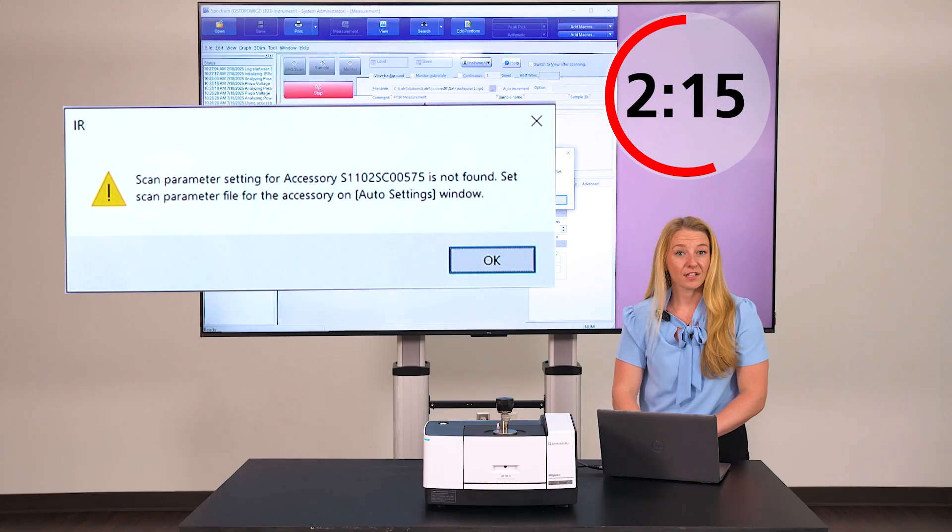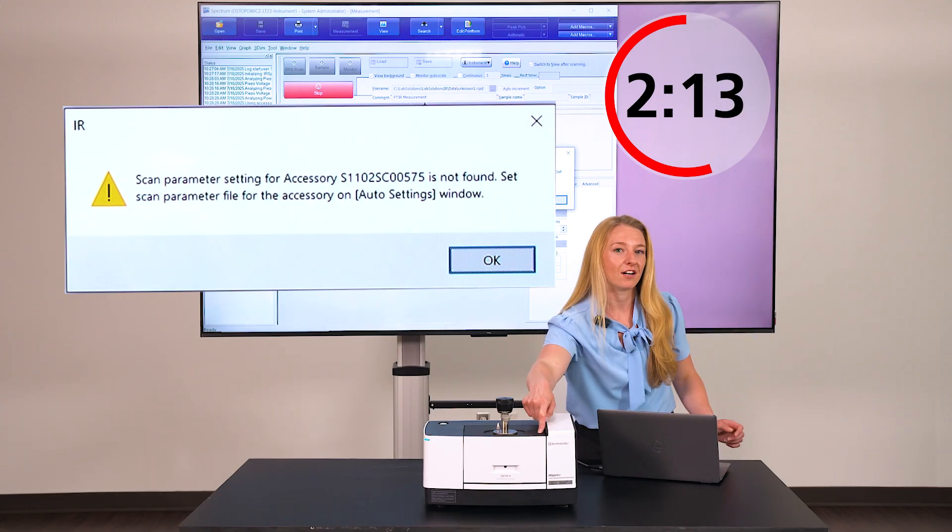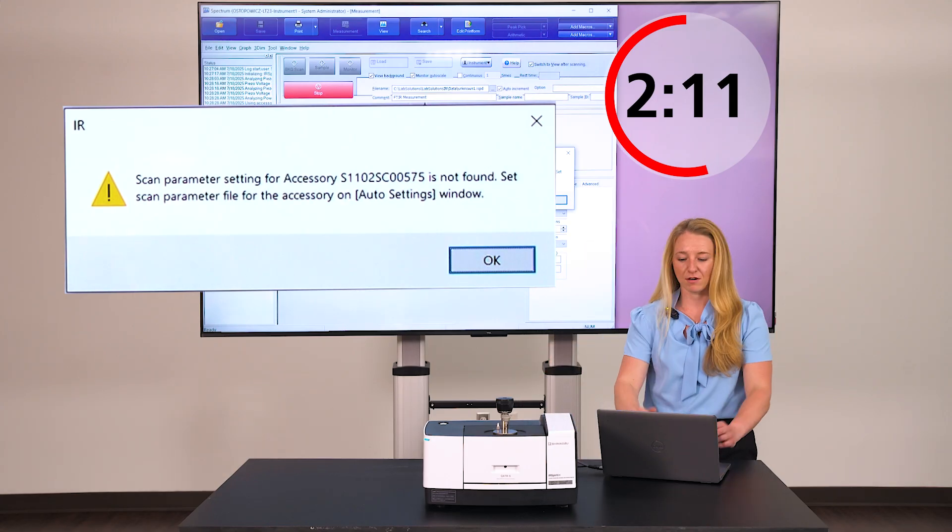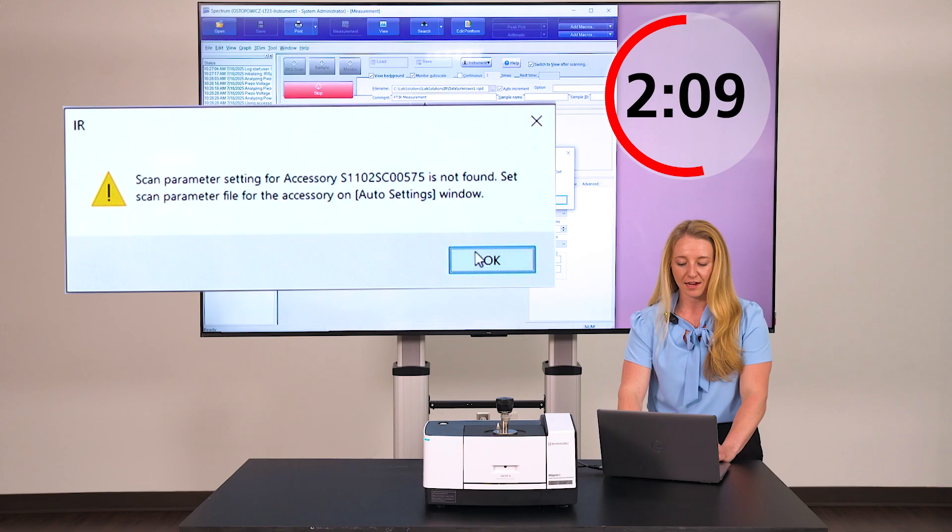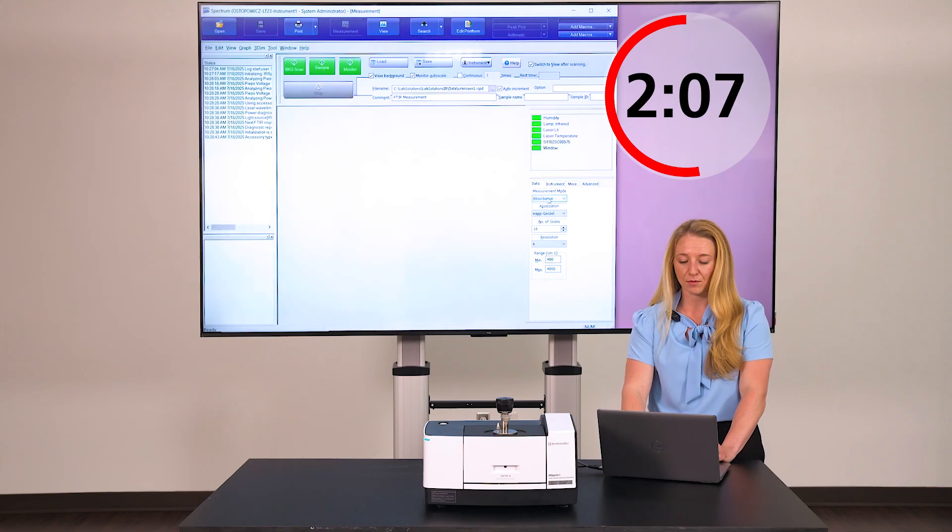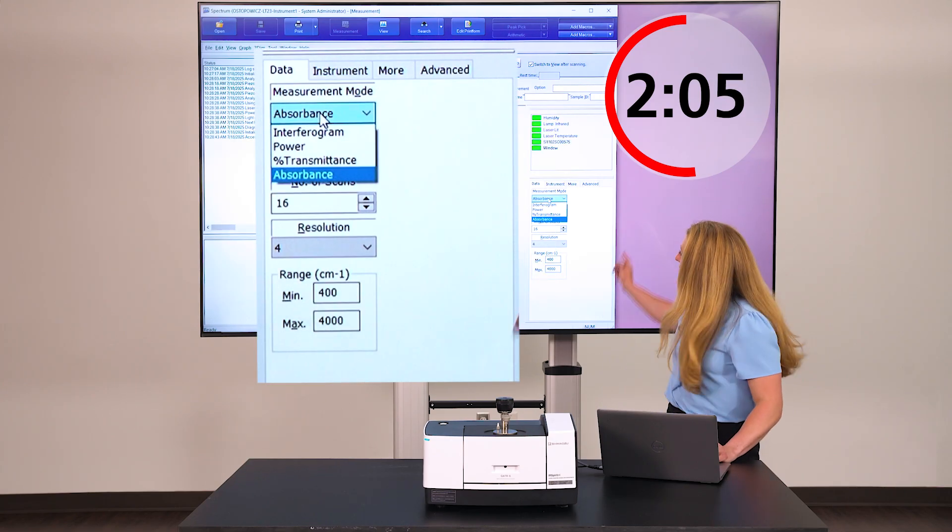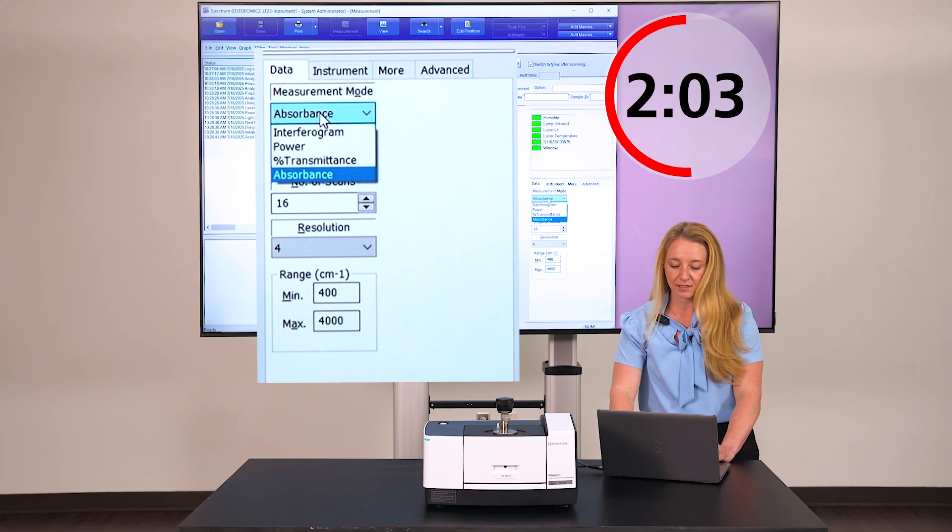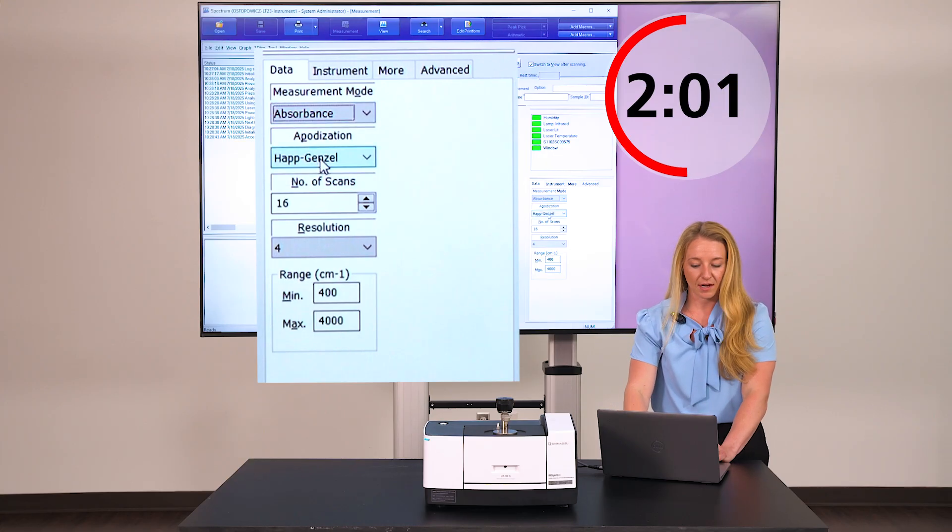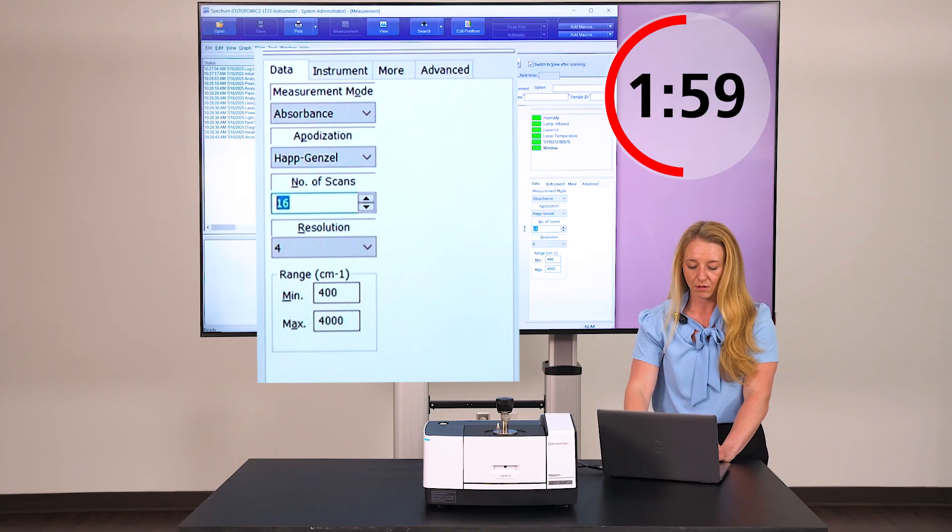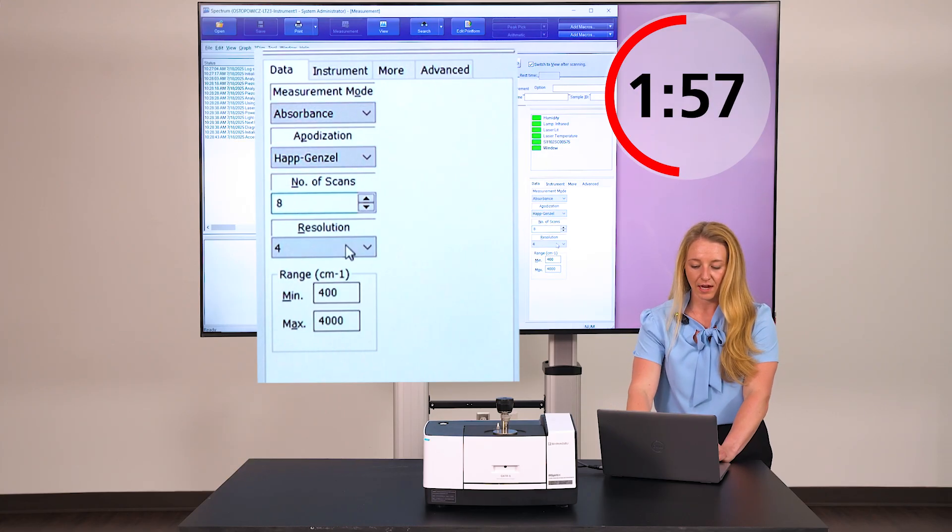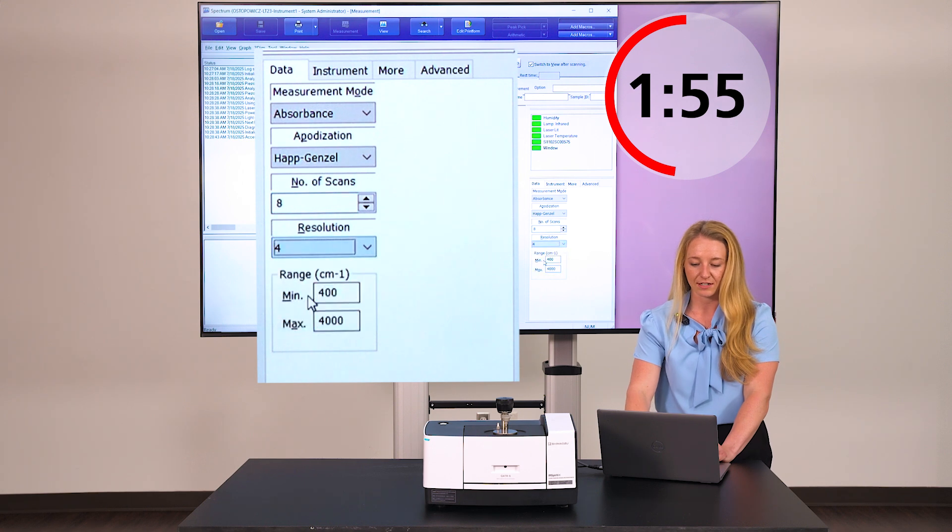This pop-up window shows that the smart chip of the ATR is recognized, but I want to set my own parameters, so I'm just going to click OK and set the parameters in this bottom box here. Absorbance is OK, I like that apodization. Number of scans, we'll knock it down to eight, and a resolution of four is pretty standard.